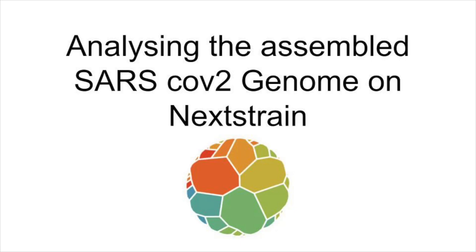In this video, you'll learn how to analyze the assembled SARS-CoV-2 genome on Nextclade.